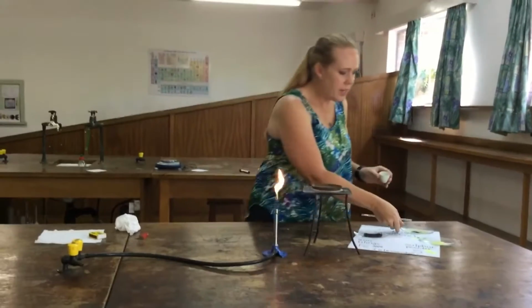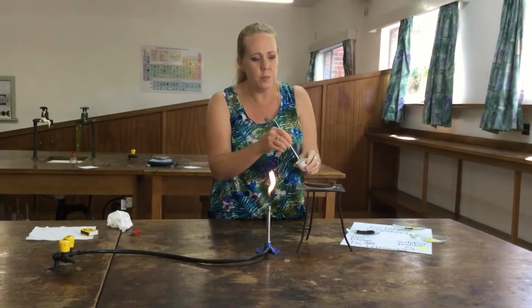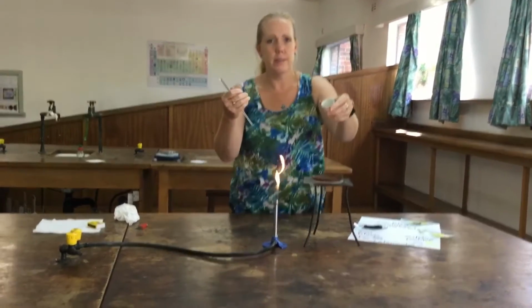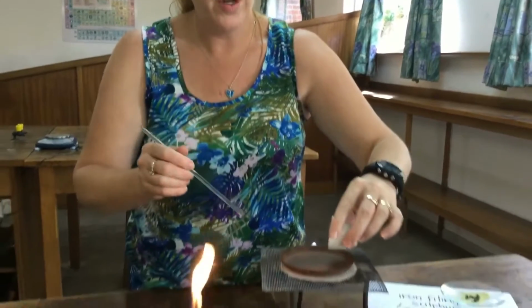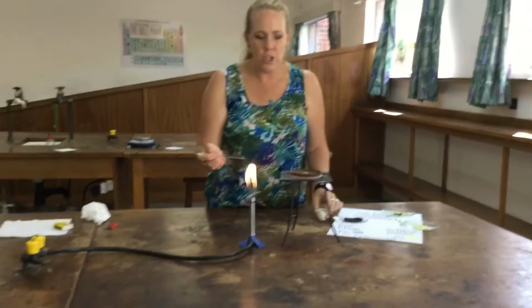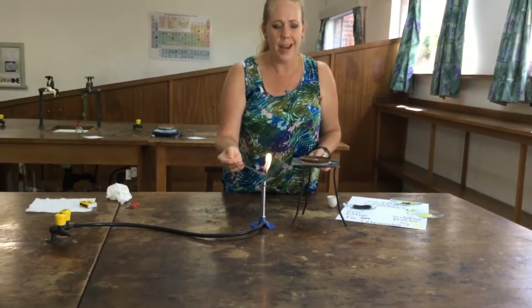Okay, so now what we've done is we've taken our mixture of iron filings and sulfur. I've put it in a little crucible here and we've just mixed it together. What I'm going to do is pour it into here, and I'm going to get this mixture of iron filings and sulfur to start reacting.